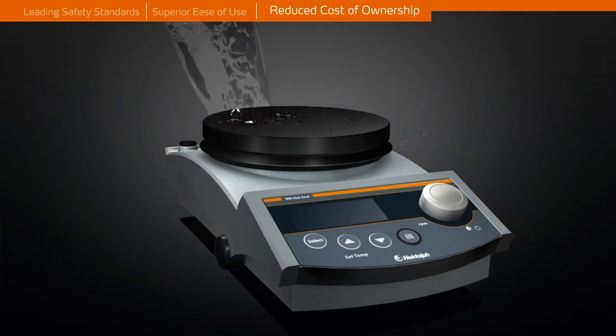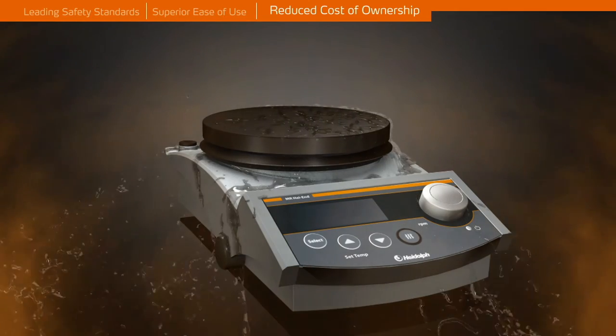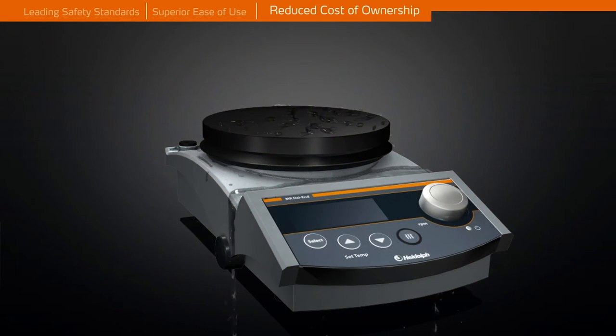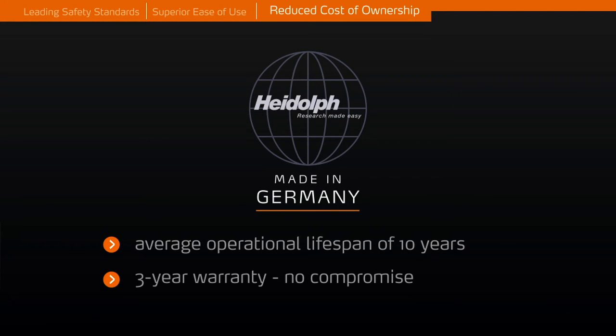Hermetically sealed housing protects all mechanical and electronic components from aggressive environments. This reduces maintenance and repair costs to a minimum and increases lifespan to 10 years on average, making your purchase a truly worthwhile investment.